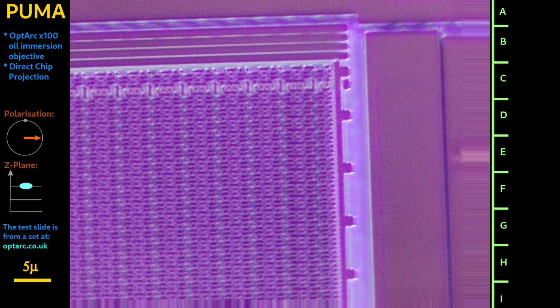These images are from the large reservoir-like areas we saw at low power. I wonder if this is some kind of memory storage. And if so, what kind?